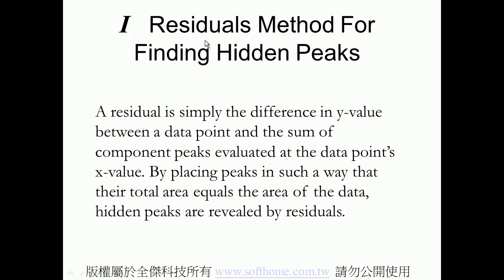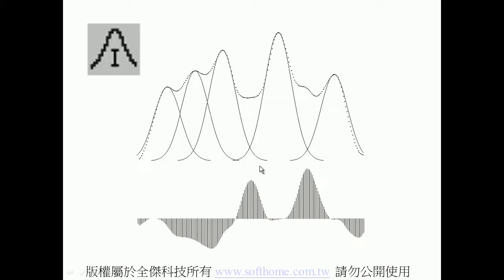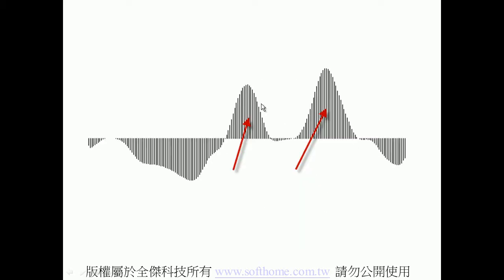The first method is the residual method. When we extract the major peak, what is left is the residual. In the upper plot, you can see the five major peaks. And in the lower plot, you can find the residual plot, which still has two peaks inside. These are hidden peaks.